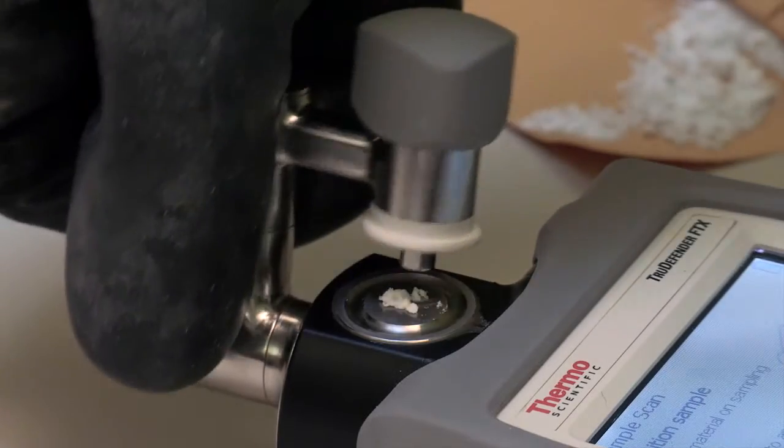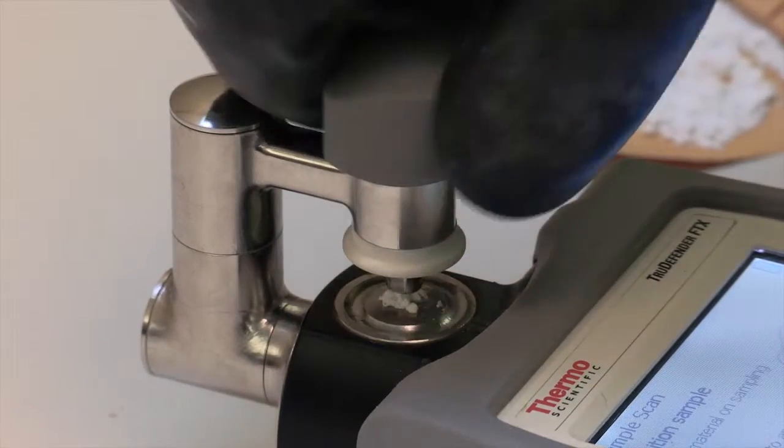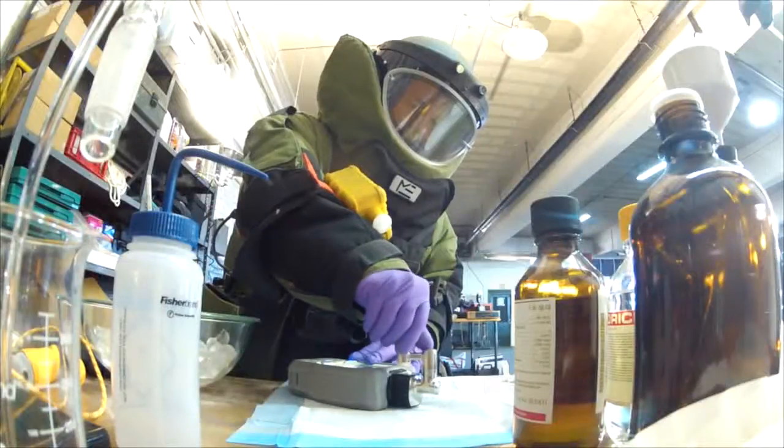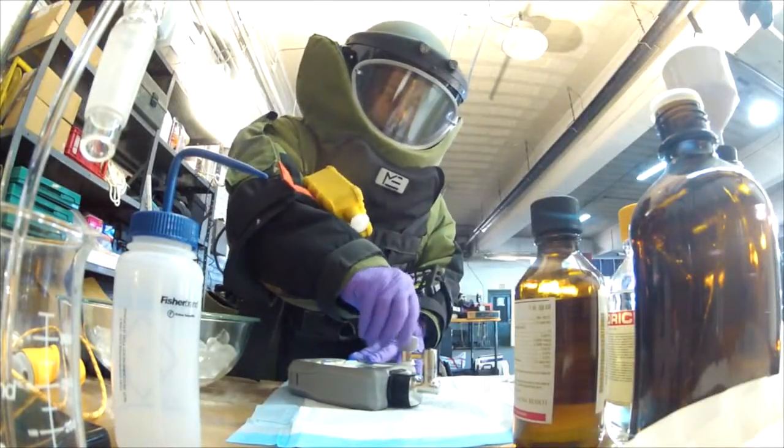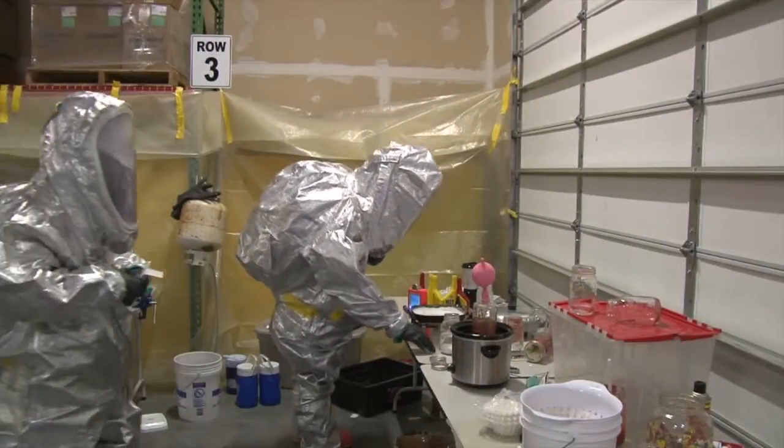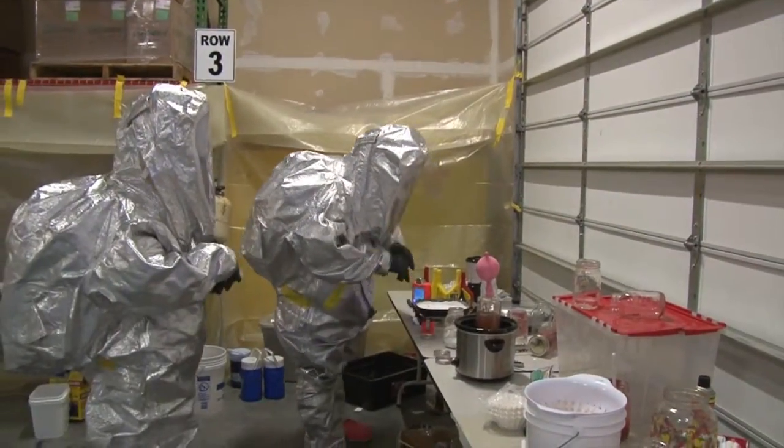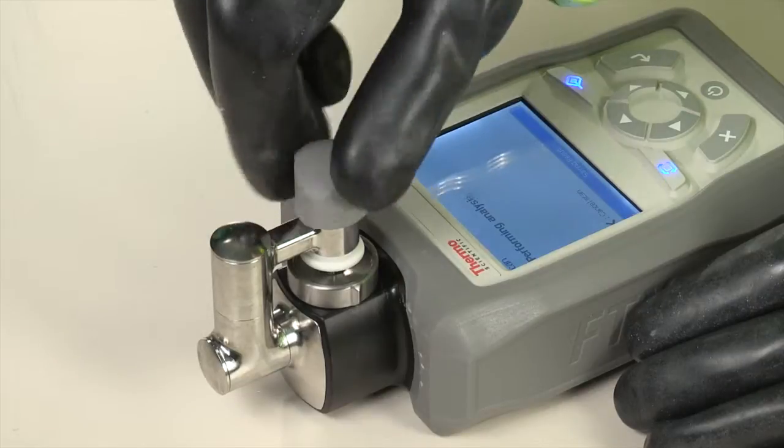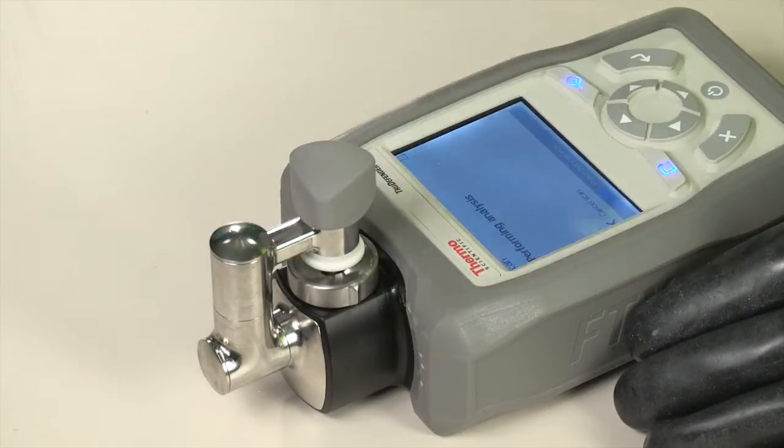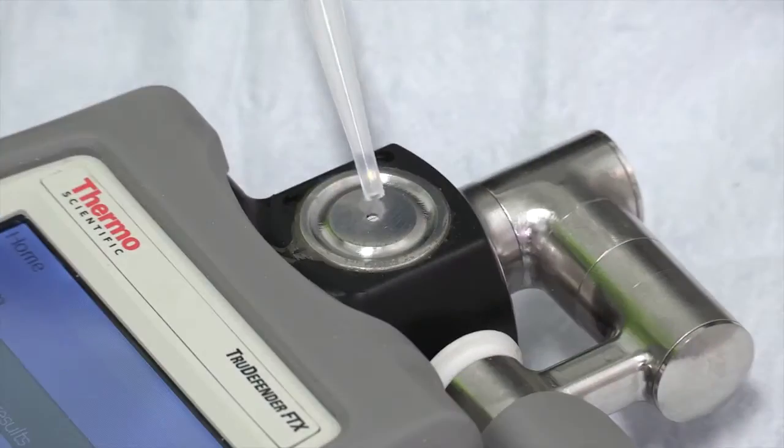The variable pressure knob allows users to apply the correct amount of pressure for a given sample. For EOD technicians, this may be less pressure to minimize risk, while for hazmat technicians testing a wide variety of unknowns, the TrueDefender FTX anvil enables increased pressure for sampling harder substances. Volatile liquids are contained within the sampling surface.